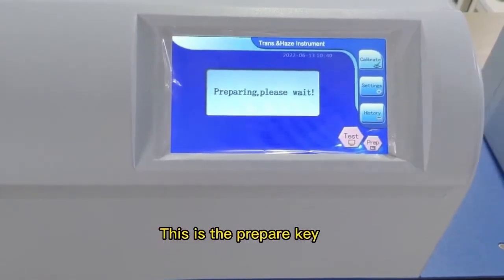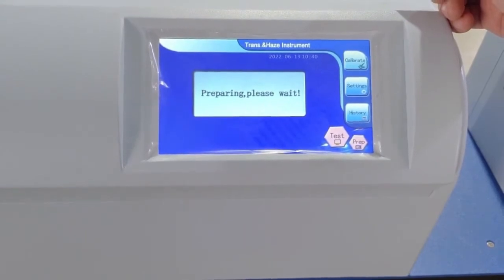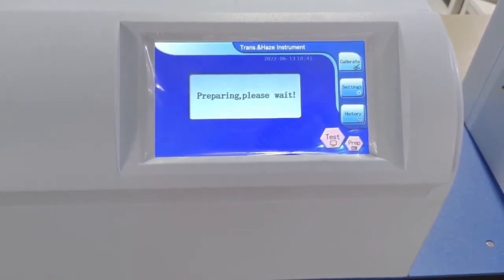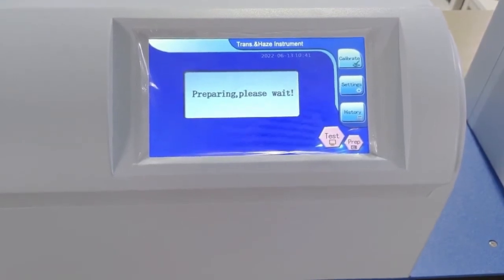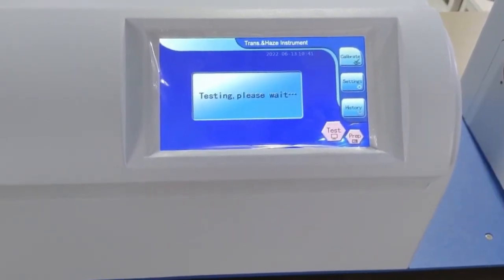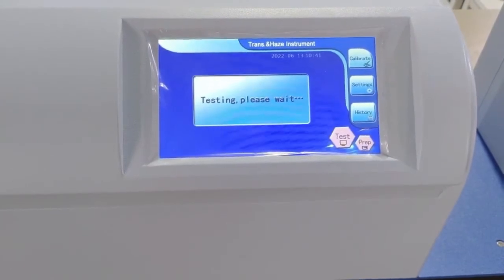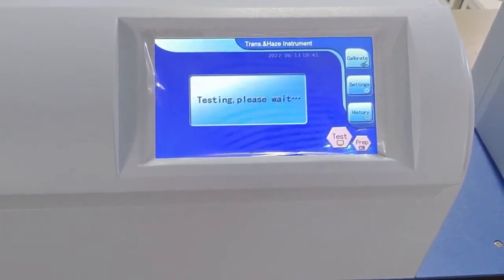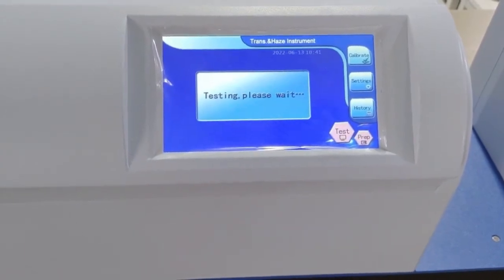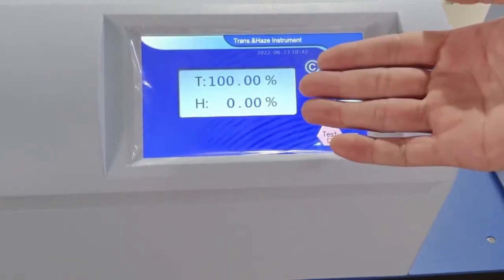This is the Prepare key. This is the Test key. The interface also shows the pit sensor area, the test section, and the assessment section.